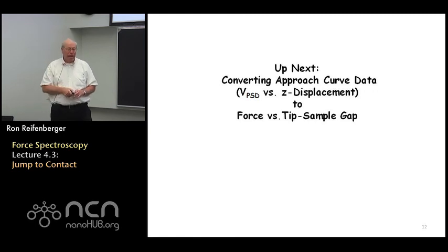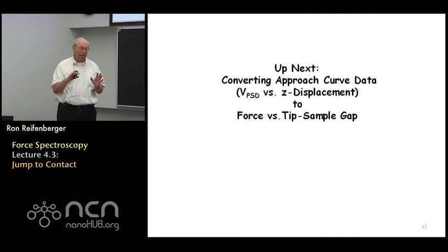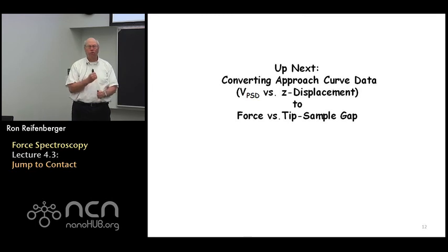I ran a little bit over time, but it's really worthwhile to understand these curves. These are curves that you can output from Veda, and they really help you understand the fundamentals of what's going on. In the next lecture, we're going to try to explain how to convert the approach curve data, that's the voltage from the photodiode versus z-displacement, into a force versus tip sample gap, which is a very fundamental quantity. So come back, that's the topic we'll discuss in lecture 4 of week 4.